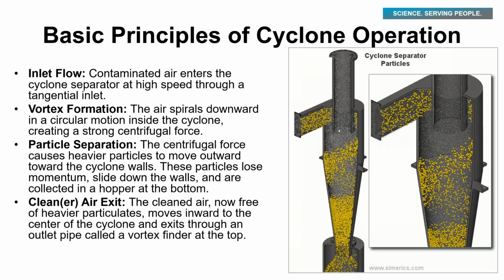In this case, they're being removed from the actual industrial process. But if you can imagine on ours, it is traveling up, and all these particles are smaller than 10 microns. And all these particles are being collected on our sampling media that we are sending off to the lab to be analyzed to tell us just how much respirable dust and how much silica is in that dust.